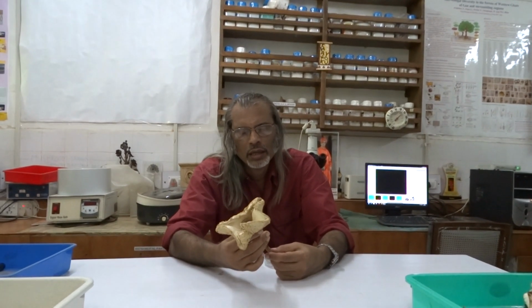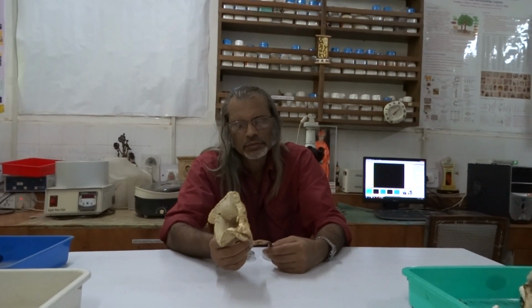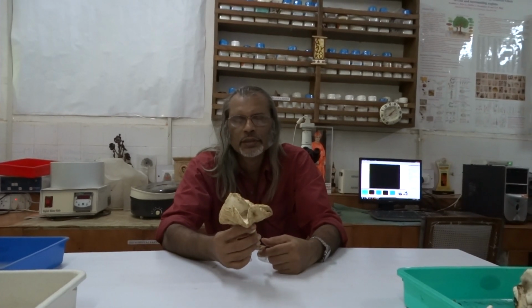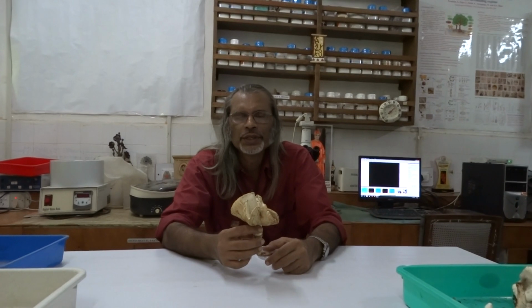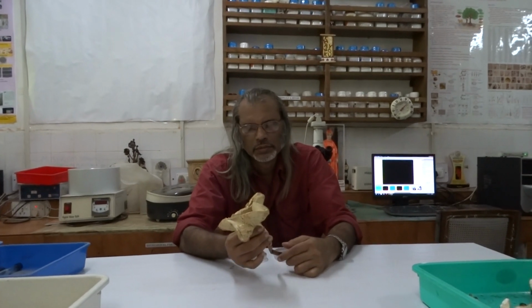We are examining a fresh crop of Termitomyces fruit bodies from Goa University campus here on 10 July 2015 in the Mycology Laboratory of the Department of Botany, Goa University, located in Taleigao campus in Tiswadi Taluka in North Goa district of the state of Goa in India.